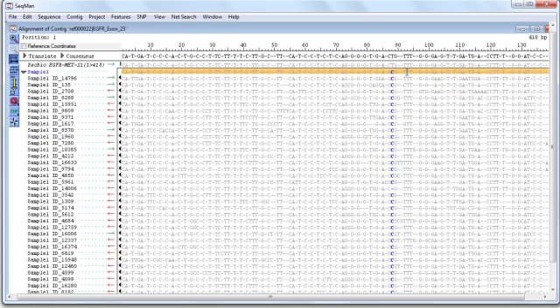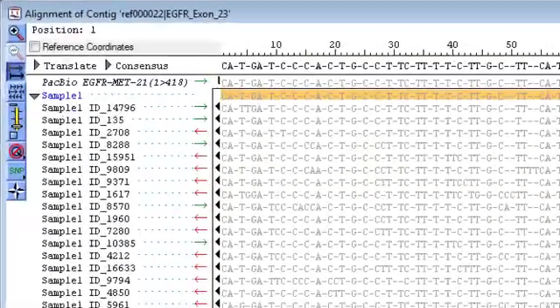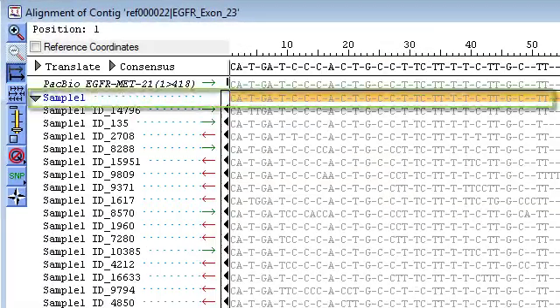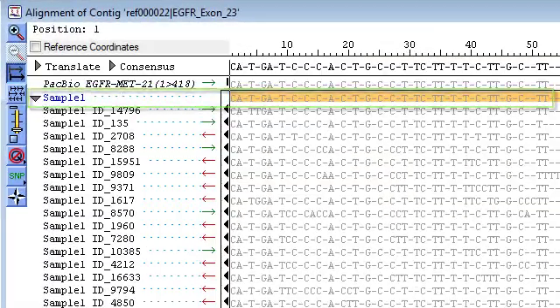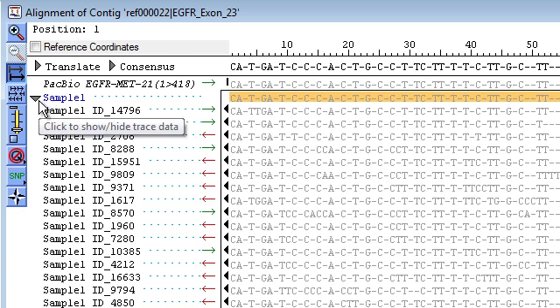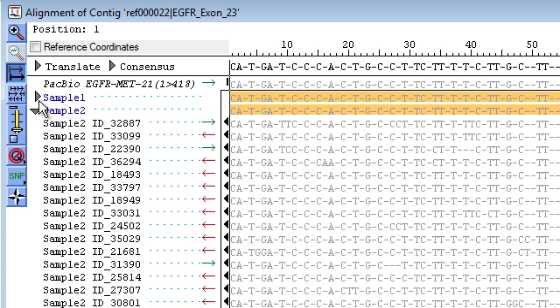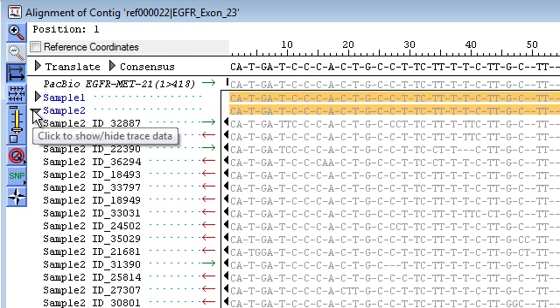And because I set this up as a multi-sample assembly, SeqMan has grouped the reads for each sample under a consensus for that sample. So to hide the reads for a sample, I just click the arrow to the left of the sample name, and then I can see the reads for the next sample.